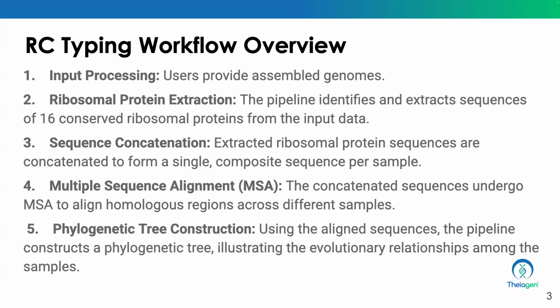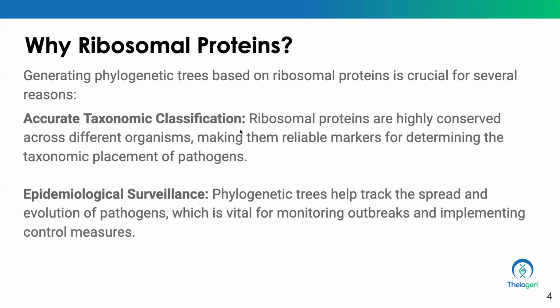All right, so I'll talk about the reference in a few slides, so I'm glad you've asked. Okay, so why ribosomal proteins? Let's start here first. Generating these trees based on the ribosomal proteins is crucial for several reasons. Remember, we are working with highly conserved ribosomal proteins across different organisms.